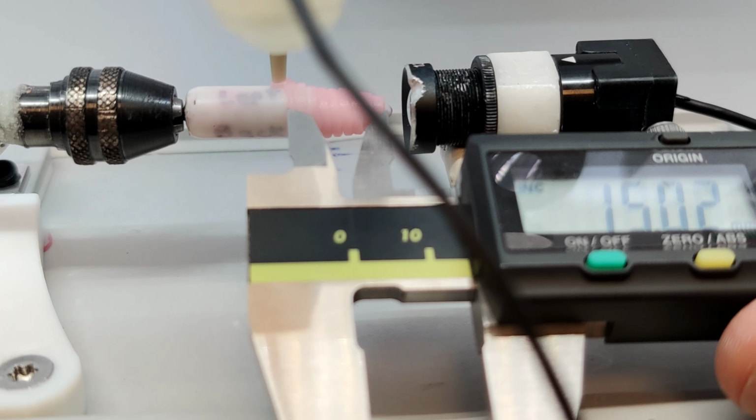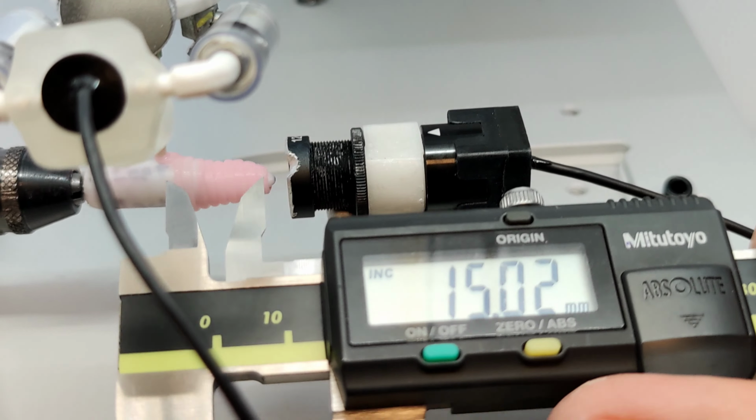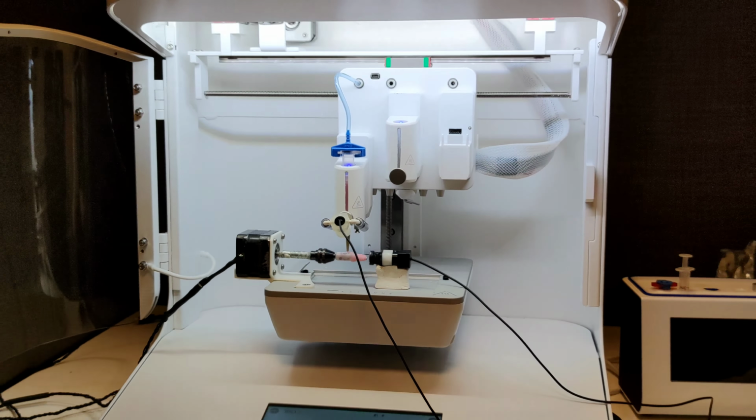Let me see, because it's not finishing yet the rotation. So yeah, it's finished already. So now it's doing the movement that is linear. And so from here to here, and this is 15 millimeters. So this is the area that is covered when you are selecting the gauge 14. So that's it. So that's all for now. Thank you.